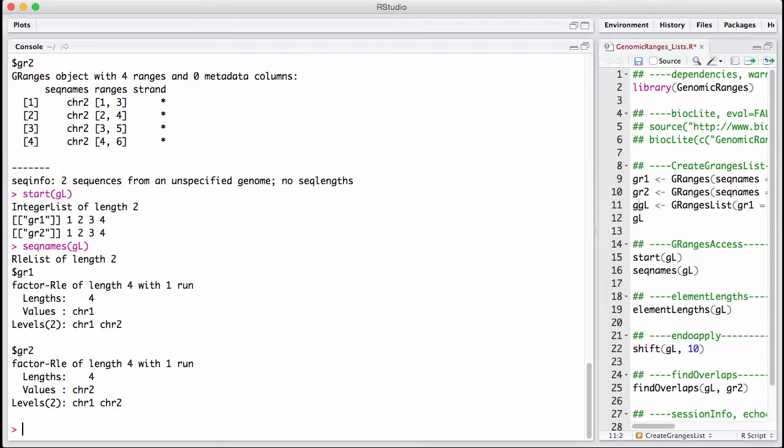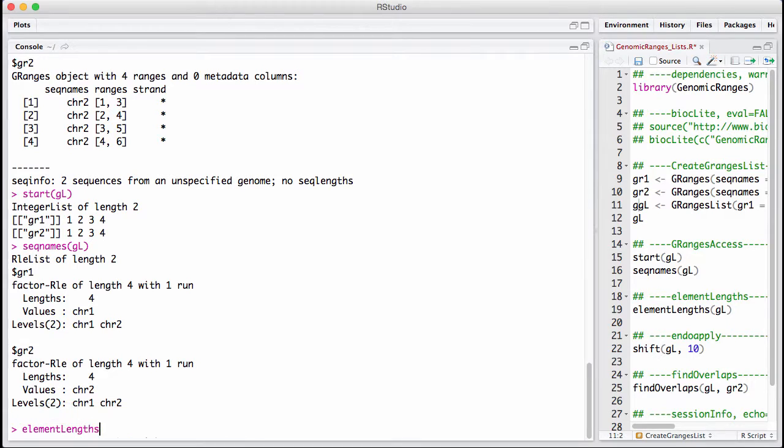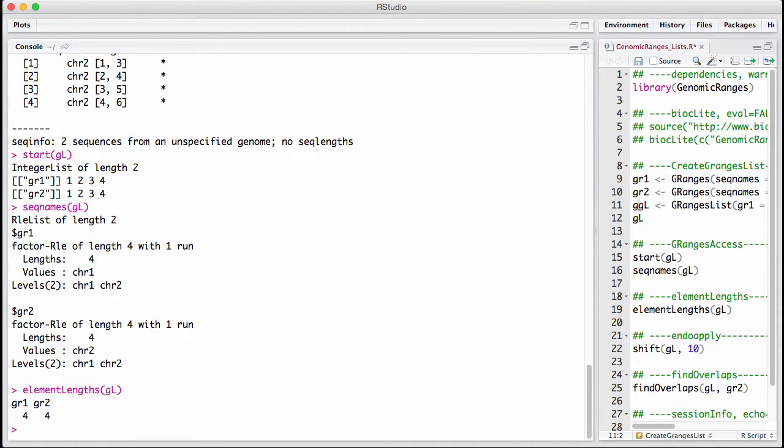There's one type of apply I use very often on gRangers lists. That's like figuring out how long are the gRangers in each of them. And there's a convenience function that is a lot faster than using SApply called elementLengths. So elementLengths just tells us how long are each of the elements. We have four ranges in each of them. It's highly useful.